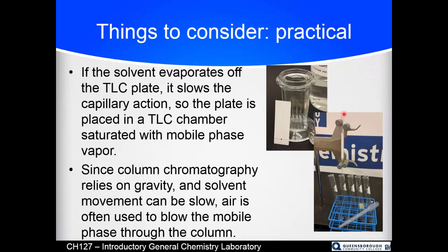We're just using a standard glass Pasteur pipette to put our stationary phase in. Sometimes the solvent doesn't drip through here very quick, and so you can take a pipette and cut the tip of it off, and use that to blow the air through here. There are specialized columns and specialized pieces of glassware for blowing air through a column chromatograph technique known as flash chromatography.